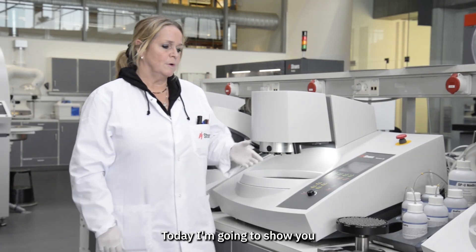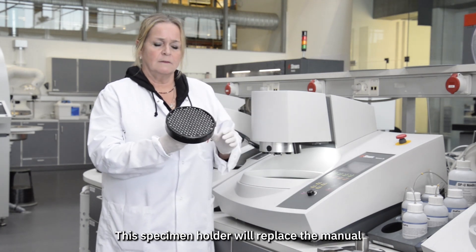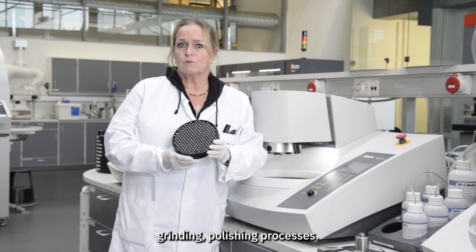Today I'm going to show you the new flexible specimen holder. This specimen holder will replace the manual grinding and polishing processes.